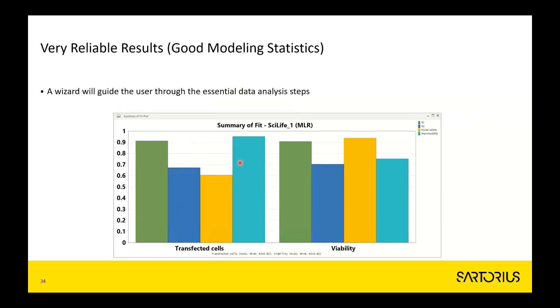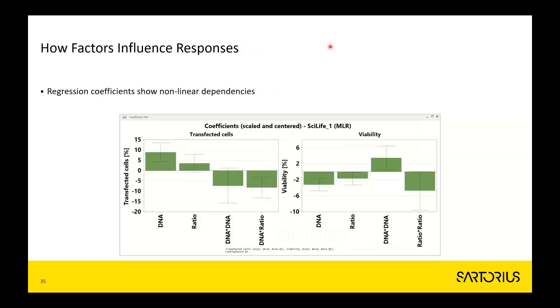Quality performance indicators of the data are presented as a quartet of bars for transfected cells and a quartet for viability, with very reliable results and good modeling statistics, meaning we can trust whatever maps or graphs we are looking at. The coefficients show some non-linear dependencies: the factors combine non-linearly to influence both transfected cells and viability.